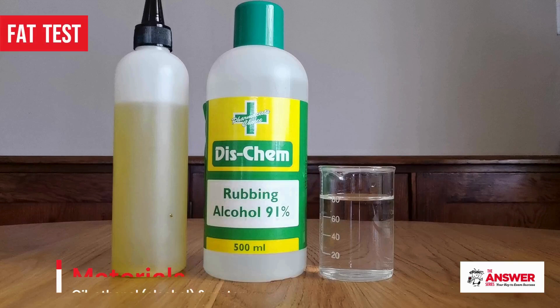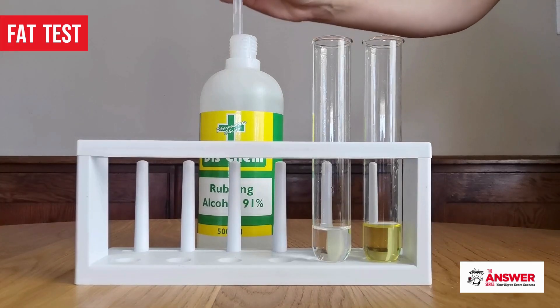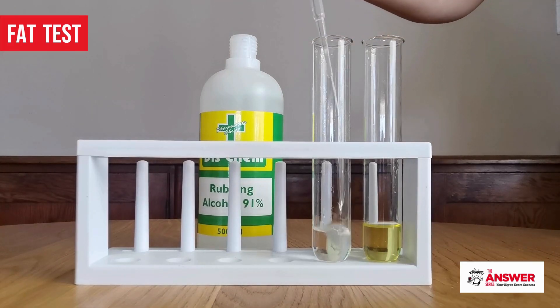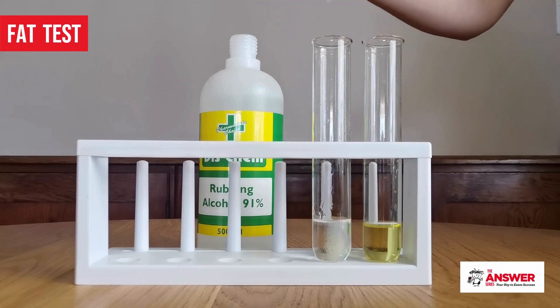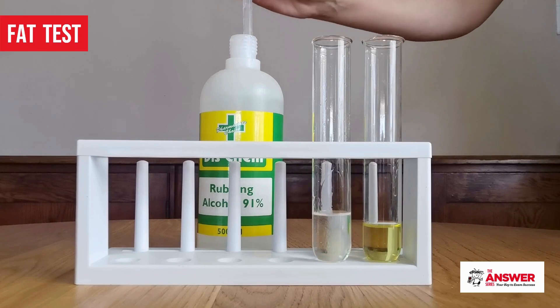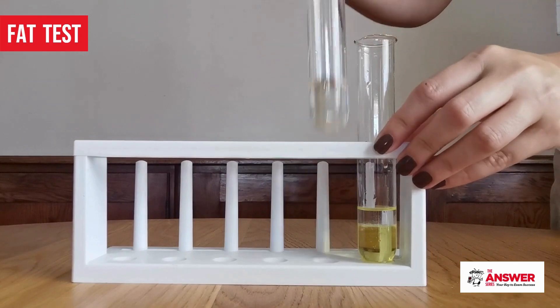For the fat test, you need a fat-containing substance like oil, as well as ethanol and water. To perform the fat test, add some oil into one test tube and water into another — the water will again serve as the control. First, add about 5 milliliters of ethanol to each test tube. I've used rubbing alcohol, which I bought at my local pharmacy. Shake the test tubes well.